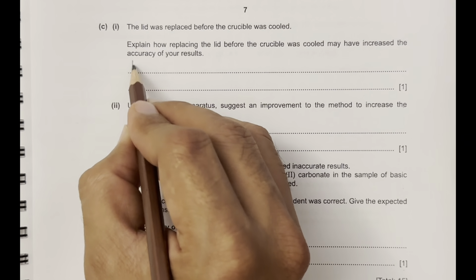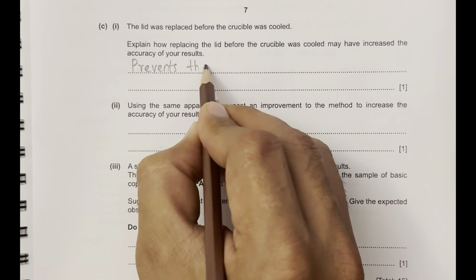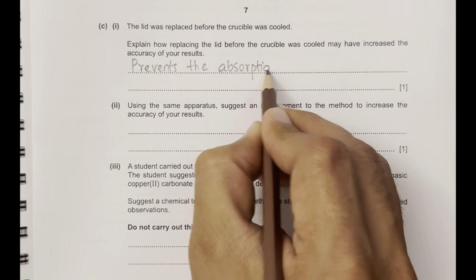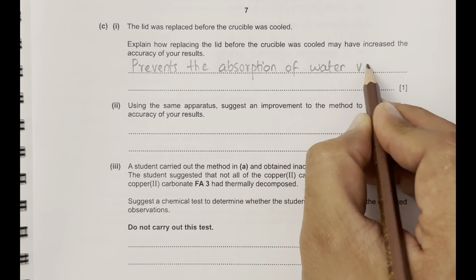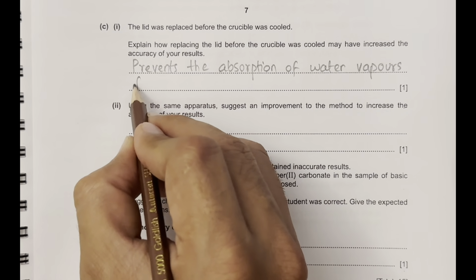So we will write here, prevents the absorption of water vapors from the atmosphere.